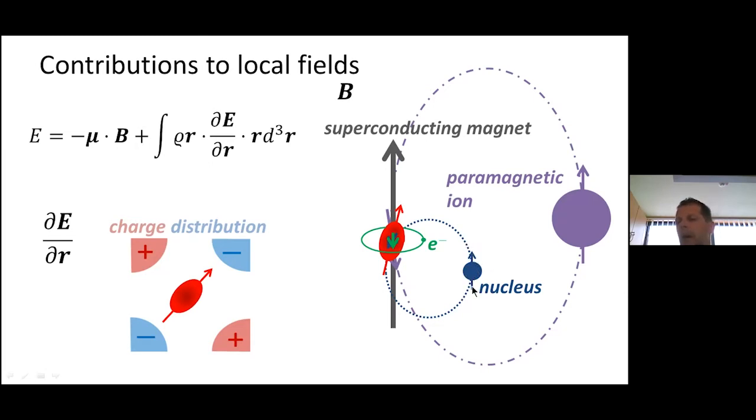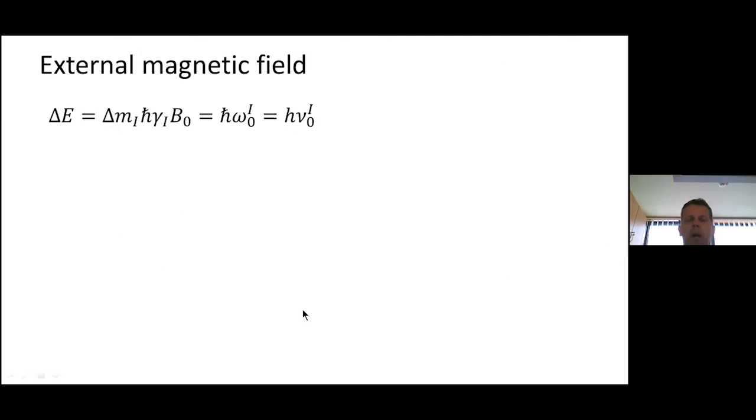And if we have a magnetic moment, like a bar magnet, a tiny nuclear magnetic moment also generates a magnetic field. So magnetic moments not only can detect magnetic fields, but they also generate magnetic fields. So our detector, the detecting nucleus, also detects the magnetic field of neighboring nuclei, and even more, it can detect the magnetic field of unpaired electrons, which are 3 orders of magnitude larger than typical nuclear magnetic moments.